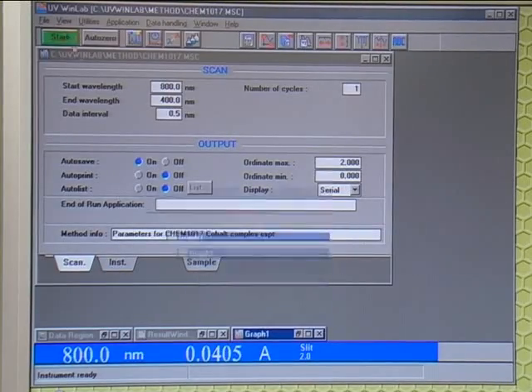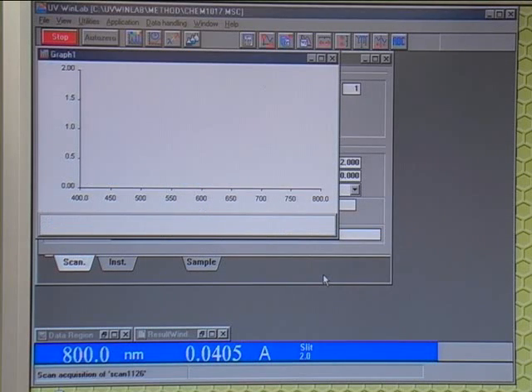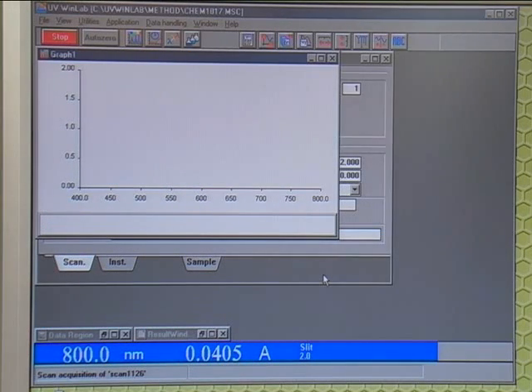Now click Start to run the program. And this will acquire your data for you.